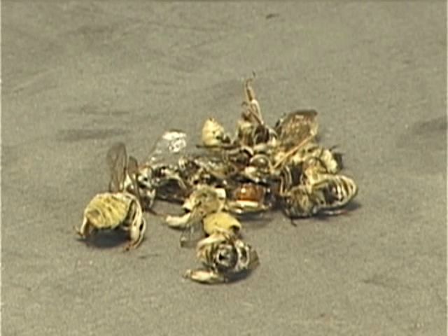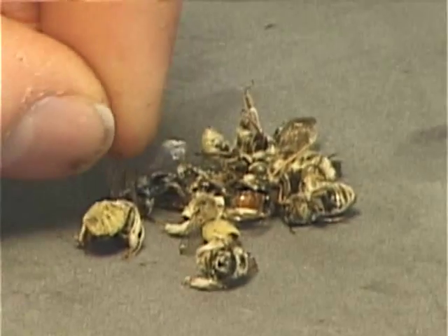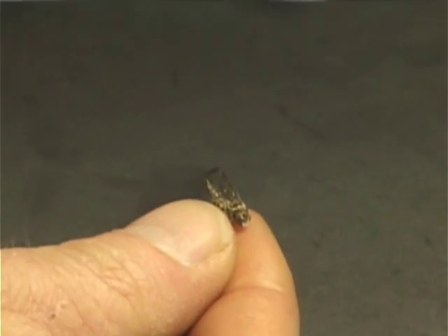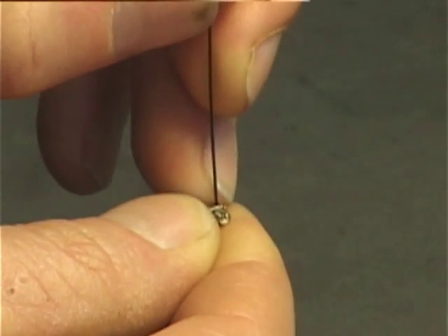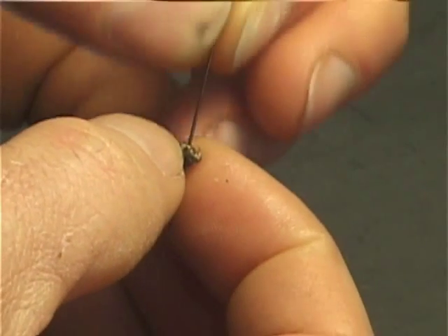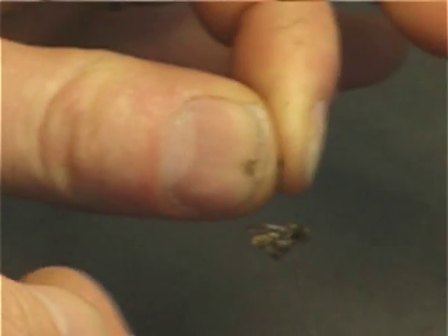Initially you'll start with a set of bees. They either come right out of a kill jar and are fresh and soft, or they've come out of alcohol and you've processed them, dried and cleaned them. What you want to do is get a pin to go through the specimen and be placed between the two tegulis, between the two front wings on the scutum.